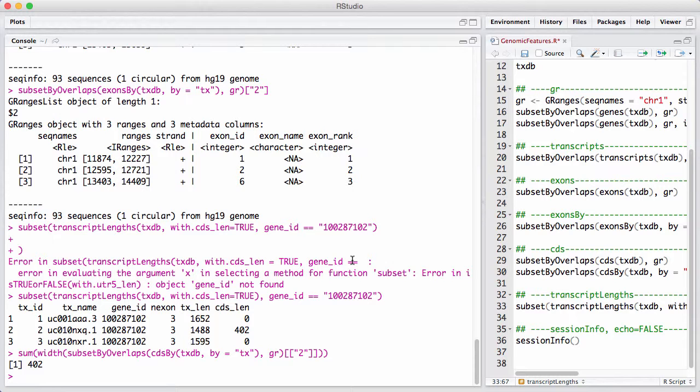So this tells you, this gives you some idea of the structure. Underneath it all, all of this is stored in something called a SQLite database. And there's a set of functions for querying this database directly using SQL commands. I don't really see the big point of this. I think these transcript, exon, cds, gene functions, and the same thing with by, like exonsBy and transcriptsBy should more than satisfy most users. You just gotta remember which one of the commands gives you what.